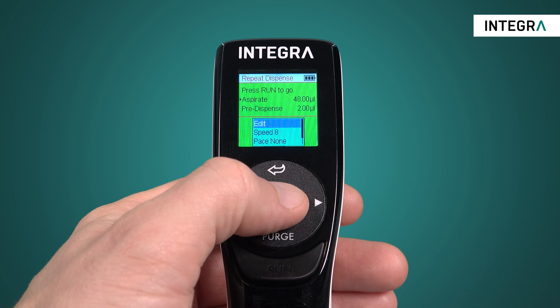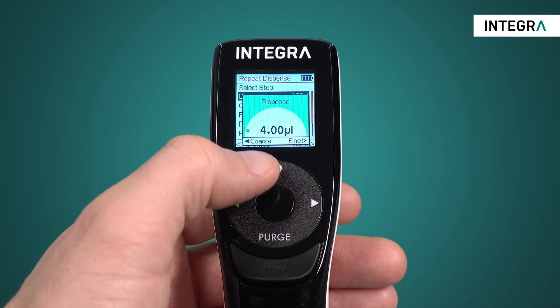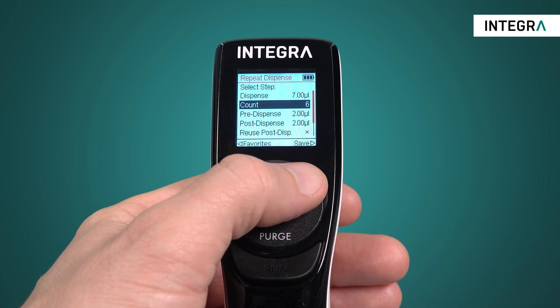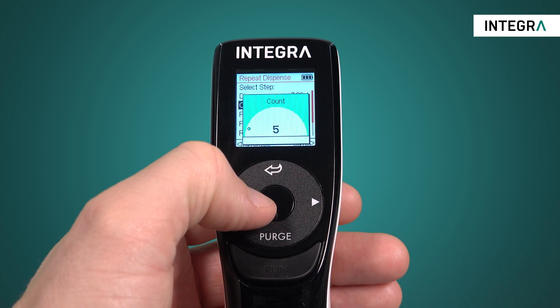Scroll to edit and press the OK button. Here you'll simply set the desired settings. For example, you'll tell the pipette what the volume of each dispense should be and how many times, or count, you'd like to dispense.